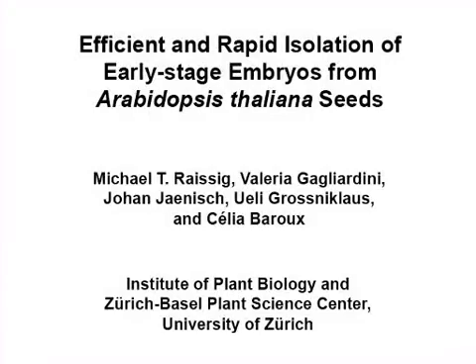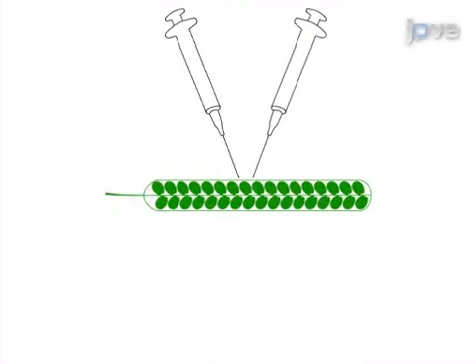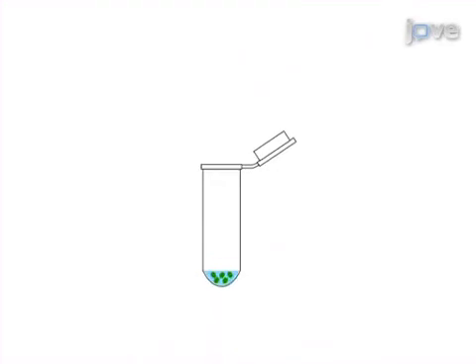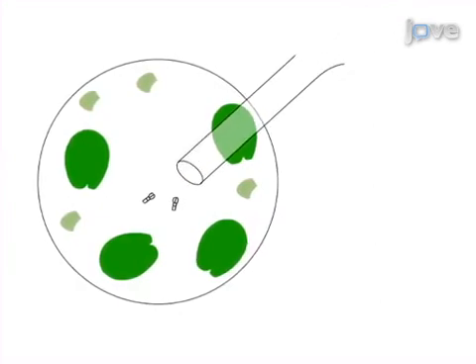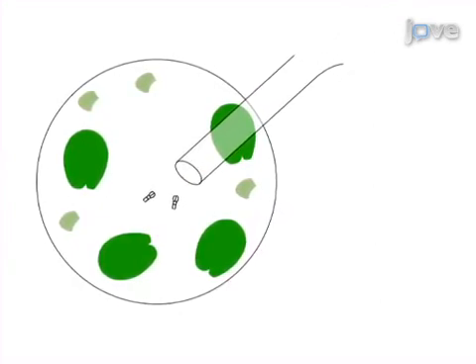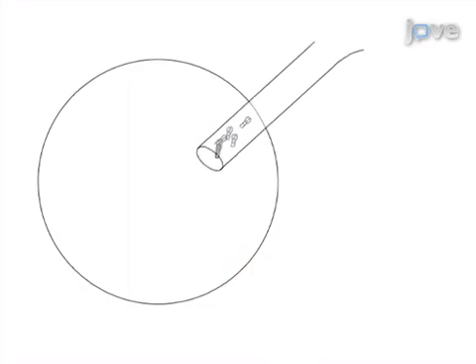The overall goal of this procedure is to isolate young plant embryos. This is accomplished by first dissecting the seeds. The second step is to gently crush the seeds in an isolation buffer. Next, embryos are screened for and then collected by micro aspiration under an inverted microscope.